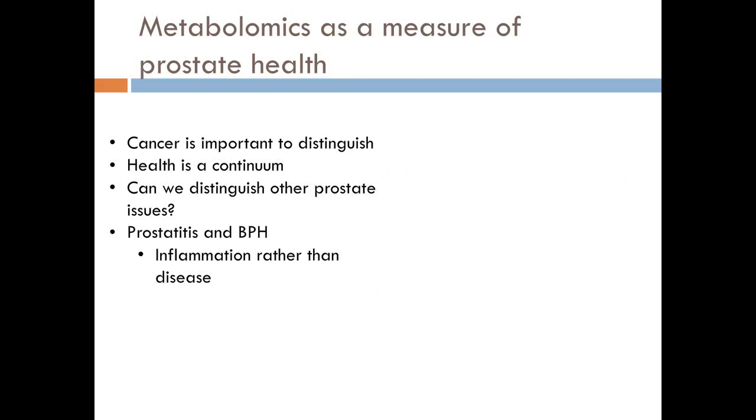And of course, you can use other statistical approaches. We like to use other statistical engines to do different validation studies, and so we often export the data from the software to then go do additional statistical analysis in MetaboAnalyst or other tools that we have at our disposal to do further validation studies.